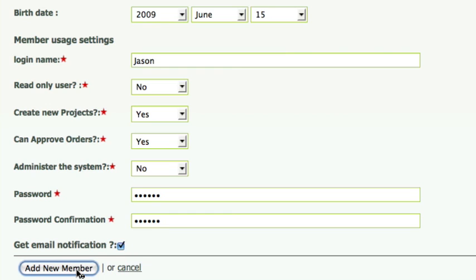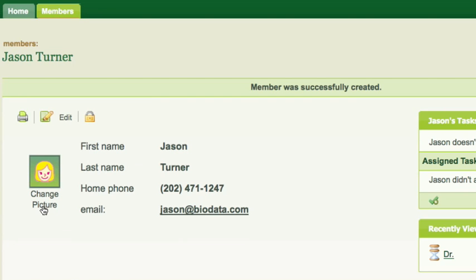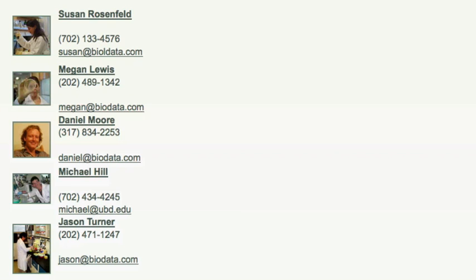Finally, I will click on add new member and Jason is now officially in the system. I can also change the picture or Jason can do it later. Thanks.